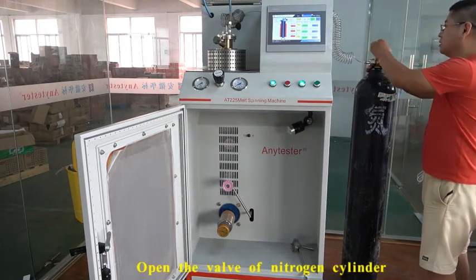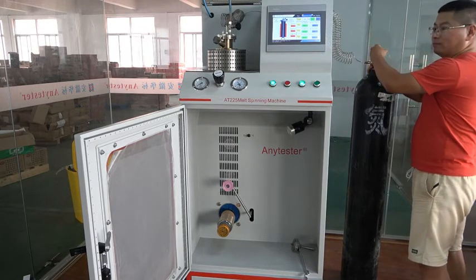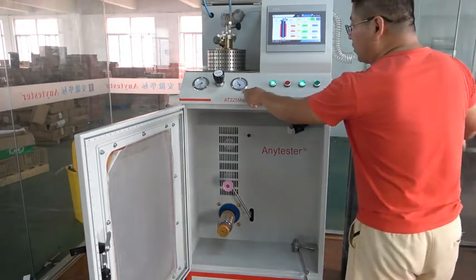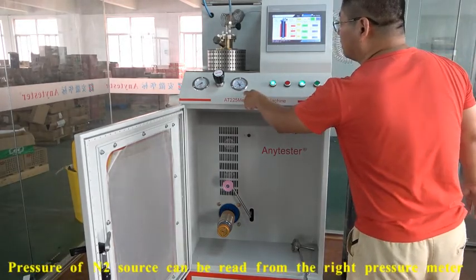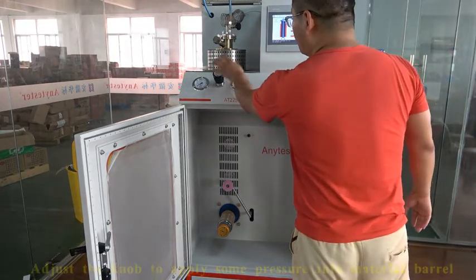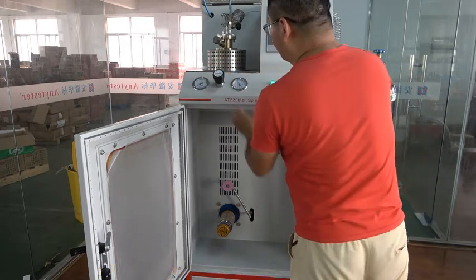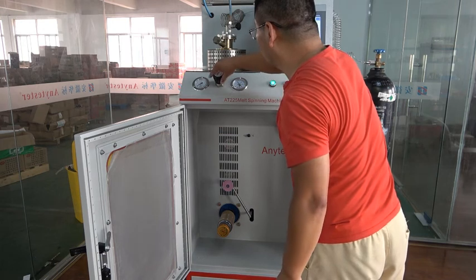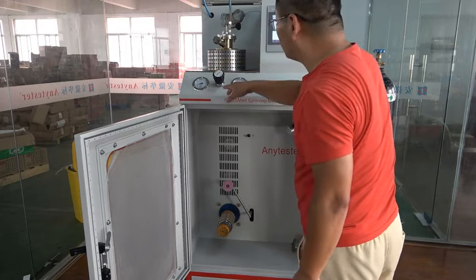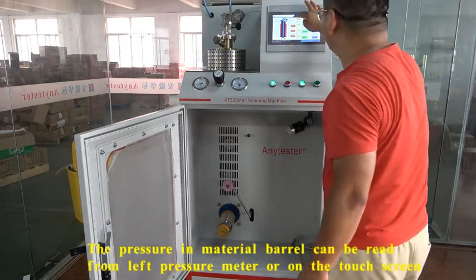Open the valve of the gas source. The gas pressure can be read here. Then apply some pressure into the barrel by adjusting the knob. The pressure in the barrel can be read here and it can also be read on the touchscreen.